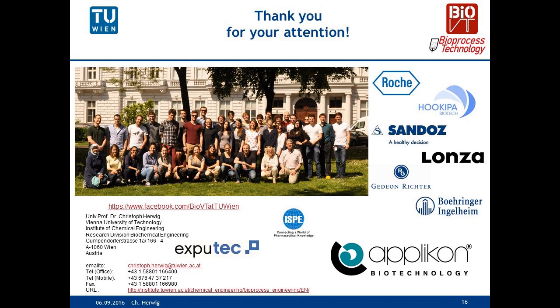And are these tools available in real time or only in offline mode? You can do both, in fact. The historical way also enables you to analyze data in addition with other samples, with IPC data, with other offline data which you may have available, to do a more detailed analysis of your process.